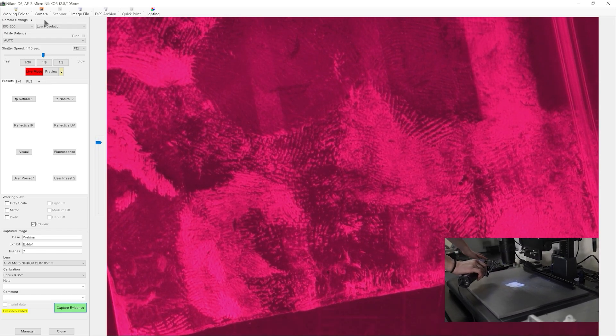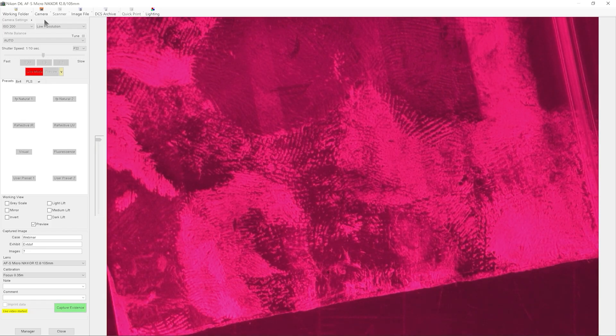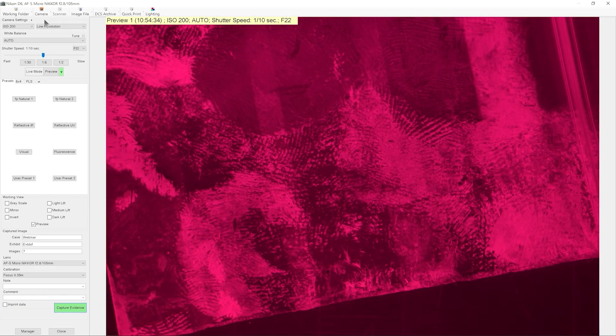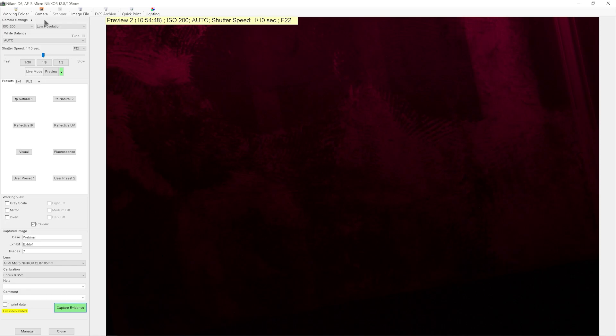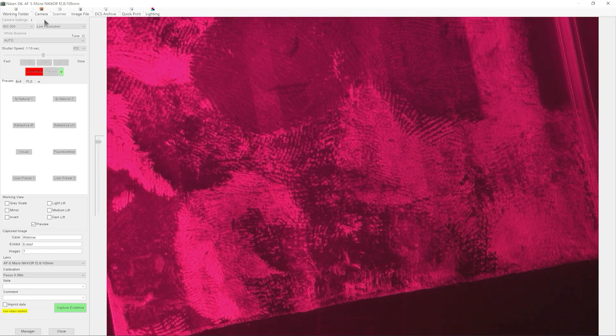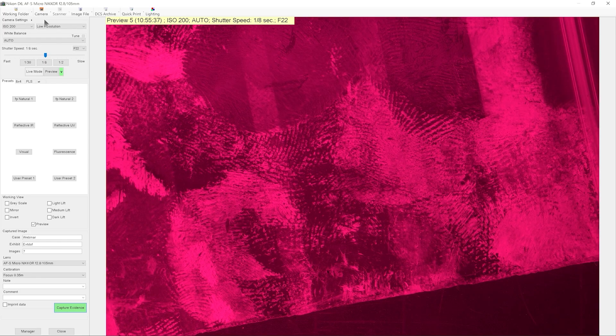What we see on screen looks quite different to what we see on the physical sample. Visibly, all we see is quite bright UV fluorescence from the surface. However, when I capture a preview, we can now quite easily see the ridge detail. The cyanoacrylate is actually scattering quite a lot of the UV light, so the ridges appear lighter than the background, which absorbs the UV light. We can now see the ridge detail running over the top of those white stripes on the plastic bag, without having to wait for a dye stain to dry.